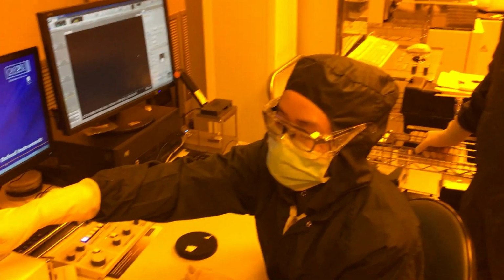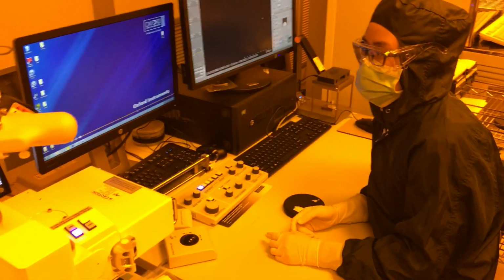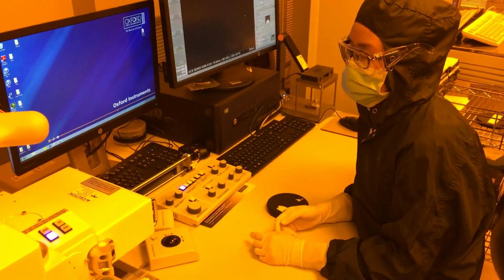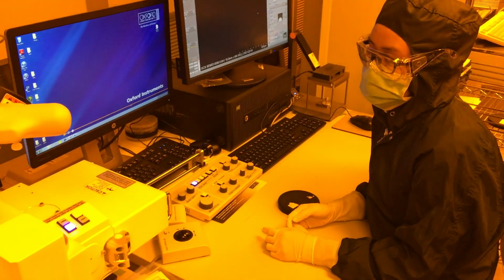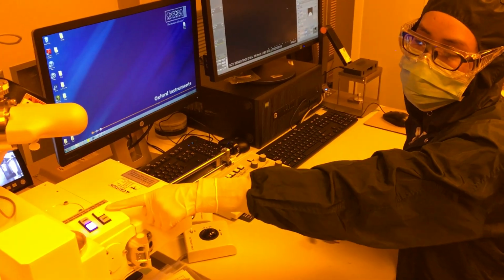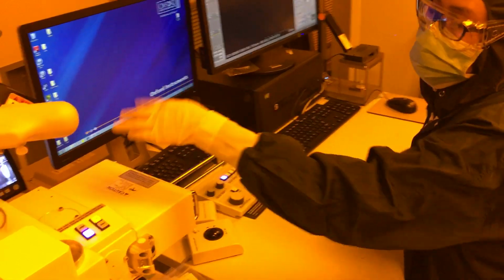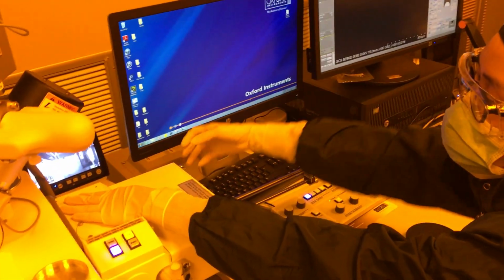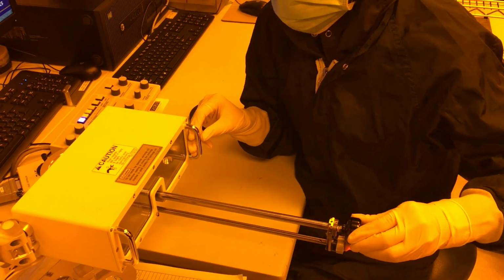On the tool, you have all these buttons. You gotta press air to vent your load lock. When your tool beeps and the light is solid, you can open it. There's a magnet, so hold on to the chamber, one hand on the handle, and then you can open it out. To push your rod out to load your sample, you gotta unlock your rod lock, push this out.